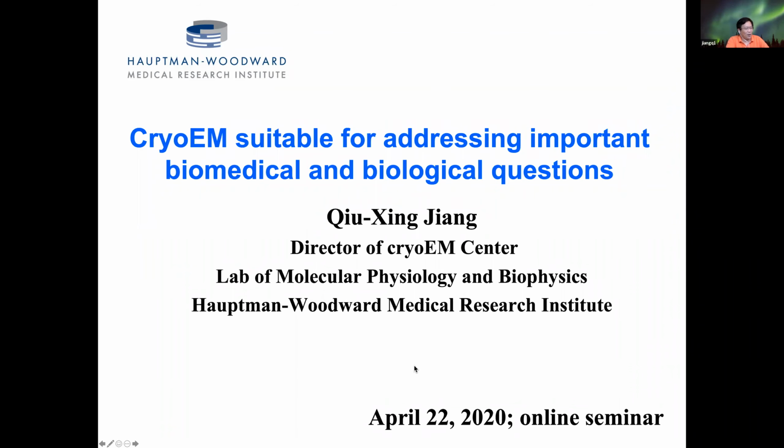So today I will give a presentation on Cryo-EM with a simple introduction, and then a couple of areas that Cryo-EM can be used for addressing important biomedical and biological questions. The center set up at Hauptman-Woodward is purposed for therapeutics development, and it's going to be dedicated for both commercial and academic users.